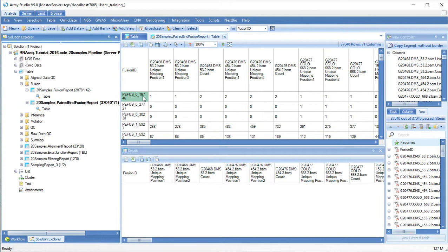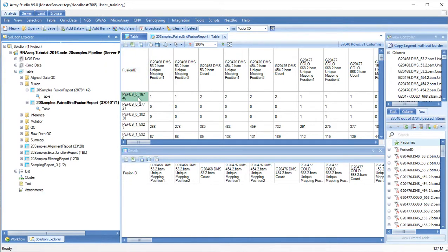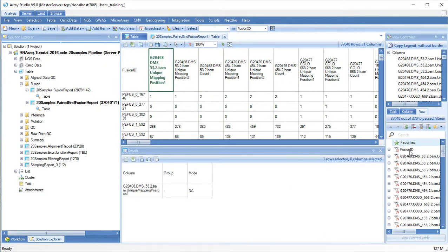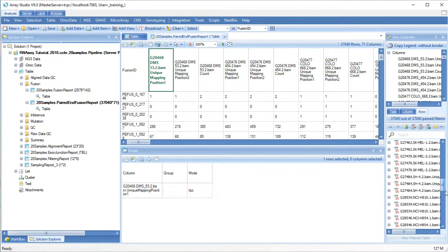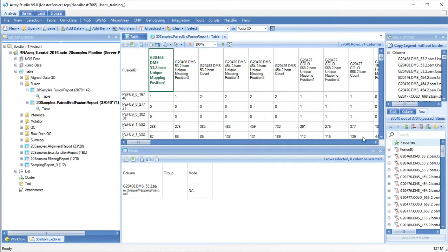By default, these reports are quite permissive and include a lot of potential fusion events. You can use sorting and filtering to find high-confidence fusion events in your data.